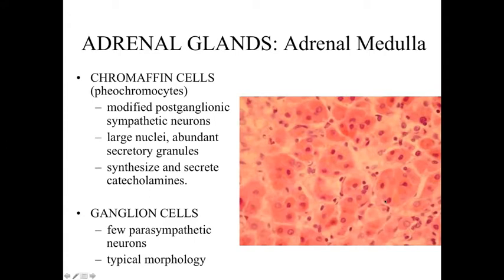The adrenal medulla is the inner region of the adrenal gland, paler-staining than the cortex. The majority of cells are chromaffin cells, or pheochromocytes — modified post-ganglionic sympathetic neurons with larger nuclei and lots of secretory granules, involved with synthesizing and secreting catecholamines such as adrenaline or noradrenaline, also called epinephrine or norepinephrine. Scattered amongst the chromaffin cells are ganglion neurons — parasympathetic neurons with a large cell body and a distinct euchromatic nucleus — but these are rarer within the adrenal medulla.